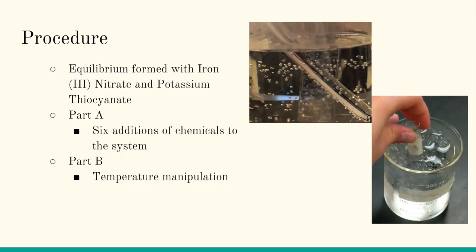In part B, we manipulated the temperature by placing the system into water that was heated to 65 degrees Celsius, and also we manipulated the temperature by placing the system into an ice water bath.